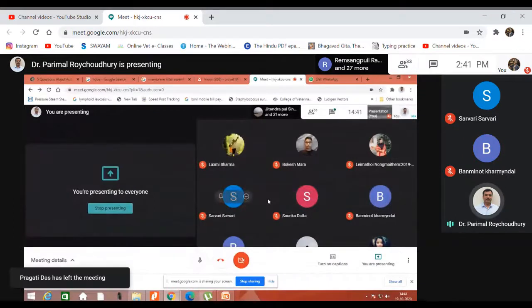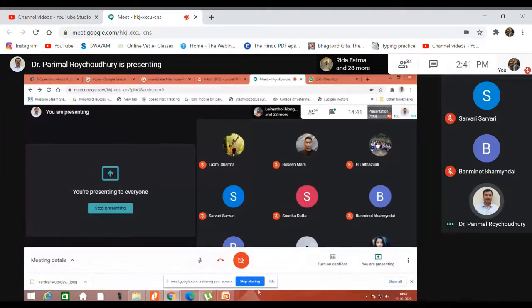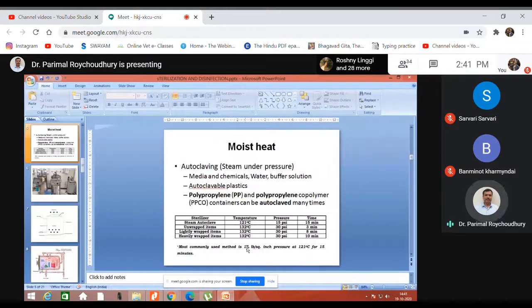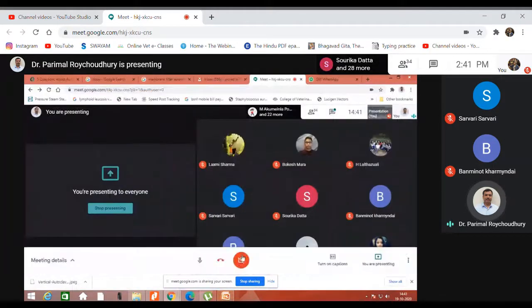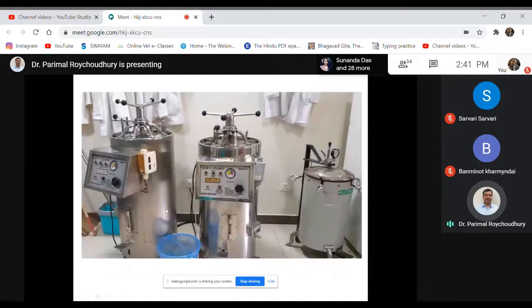Okay, so these are the two processes, hot air oven and autoclaving, which are most commonly used in a microbiology laboratory for sterilization purposes. Okay, and let me remind you, these are called sterilization processes. So let us see a little bit about these equipments, 3 autoclaves that we are running in our lab on a regular basis. One is meant for discarding the waste. For example, once the culture work is finished, we disinfect and sterilize it by this equipment, and the other 2 we use for normal routine sterilization.